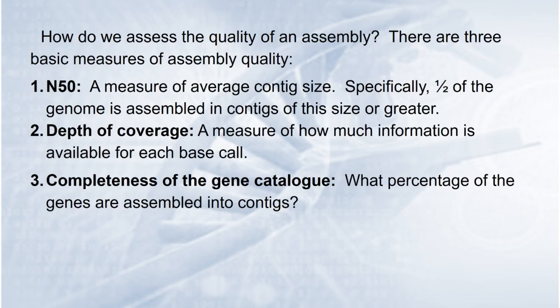The next thing that you'll want to consider, and this will be one of the steps in your analysis, is a report that you produce here, which is our way of understanding, when you do an assembly, how good an assembly you have. There's a couple of ways that we talk about our assemblies that are very common.